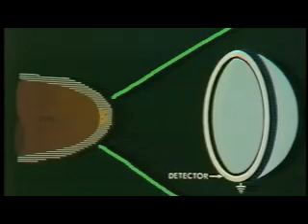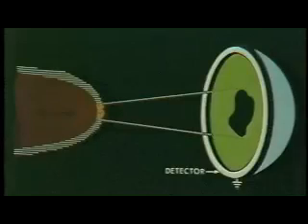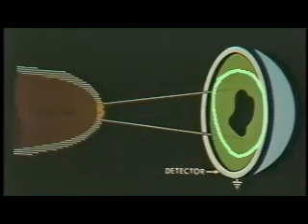For benzene. What does that mean? That means the molecule doesn't go away, but we can remove the layer of ice. What does that do? Well, remember, we can self-image this ice layer by time gating, for whatever that species is, and then look at the image that's formed on a detector. What you'd expect to see as you raise the field strength is a dark region appearing as we begin exposing the contour of the molecule in the ice layer.